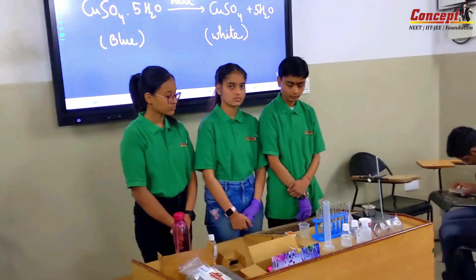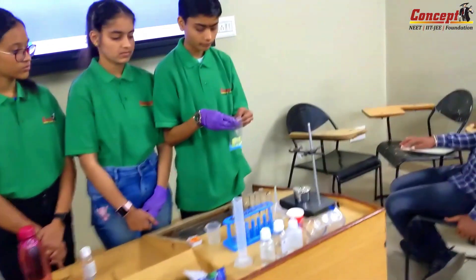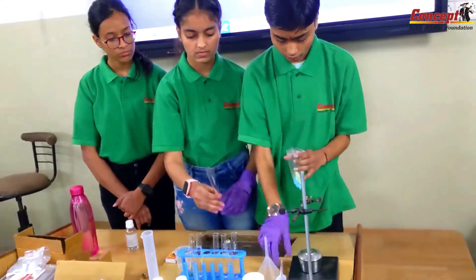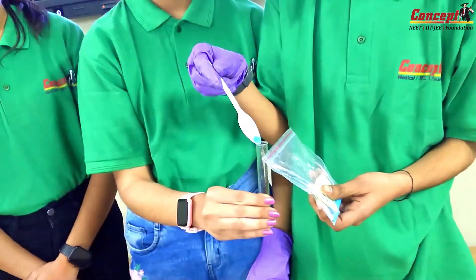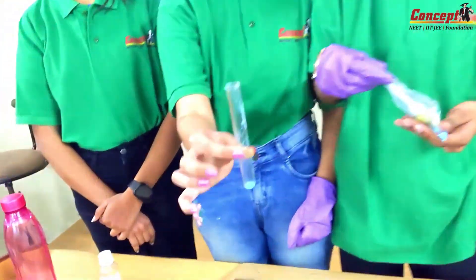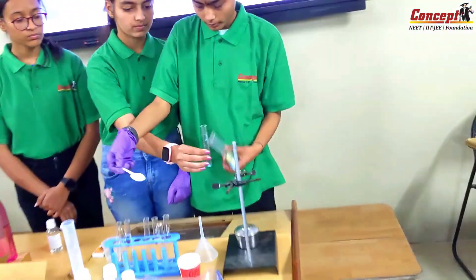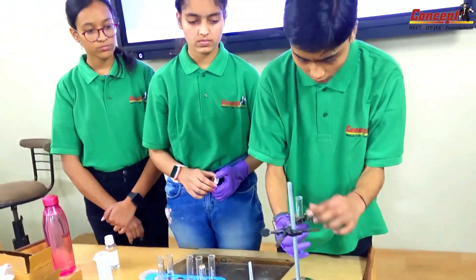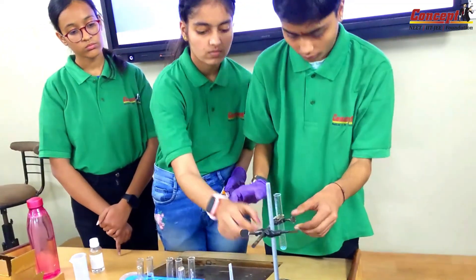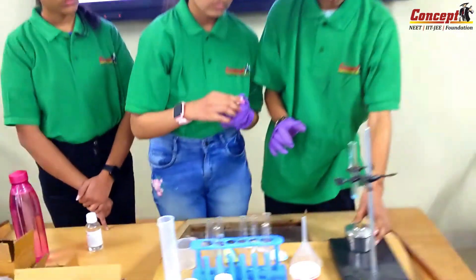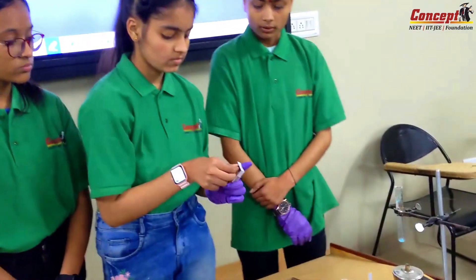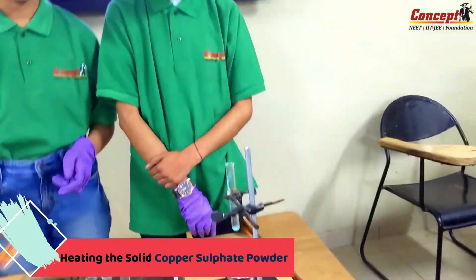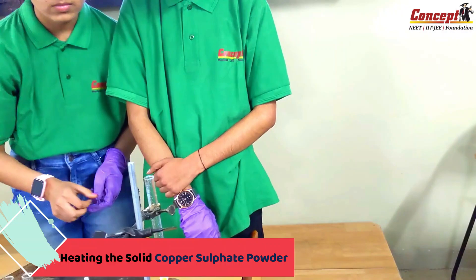Take some copper sulfate, hold the test tube, and clamp it in the retort stand. Now let's try to heat it up. Take the lighter, light the burner, and put the test tube a little below.